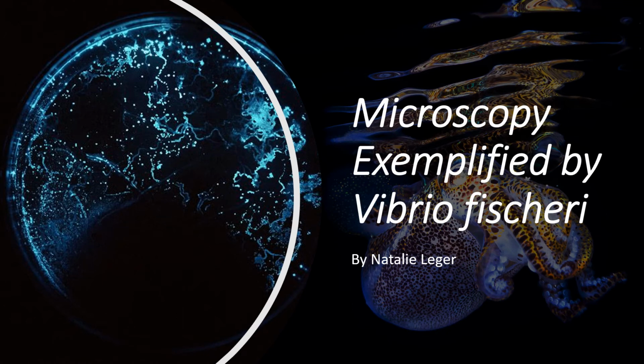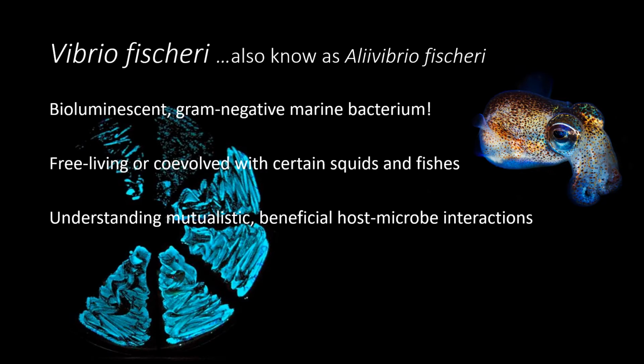Today I'm going to be comparing different variations of microscopy to optimize visuals with the microbe Vibrio fischeri. Vibrio fischeri is a bioluminescent marine bacterium that has evolved with the Hawaiian bobtail squid, seen on the right.